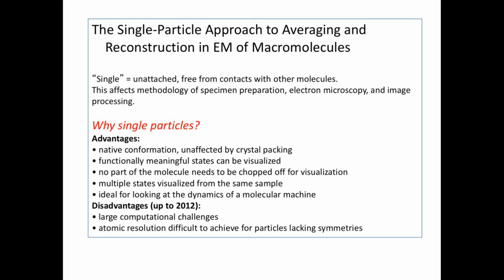Well, they are in the native conformation, unaffected by crystal packing, because when X-ray crystallography is done, molecules just have to assume a minimum in their conformation, in their energy, to accommodate the whole crystal packing.